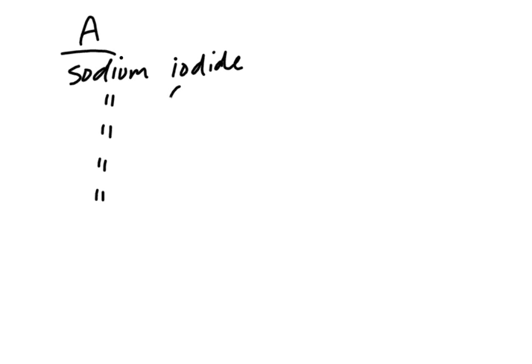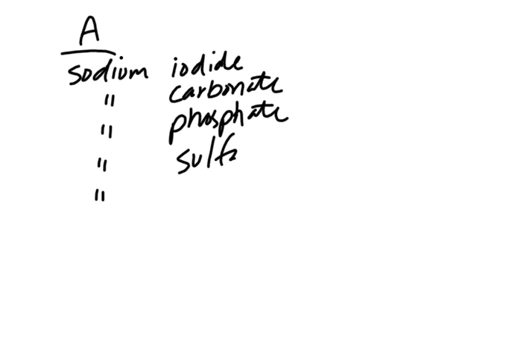We have sodium iodide, sodium carbonate, sodium phosphate, sodium sulfate, and sodium hydroxide.